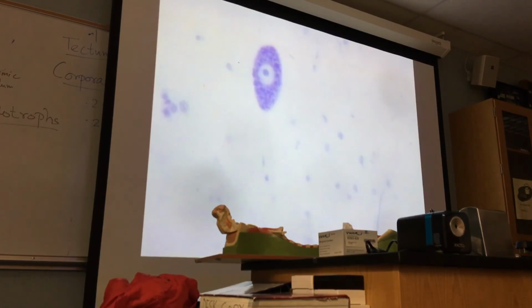All right. And look at that. These are the neuroglial cells. Also, they show some positive reaction because your cell will have RNA, no doubt. Okay? Any question? Two slides down.